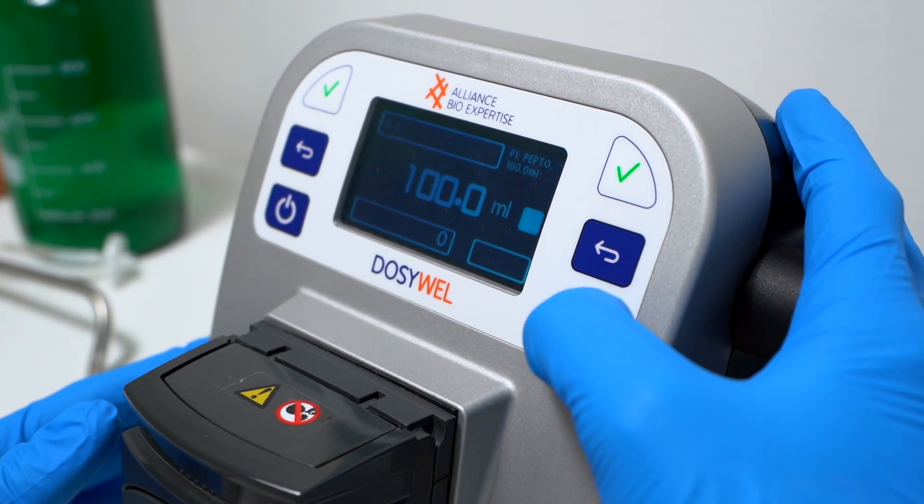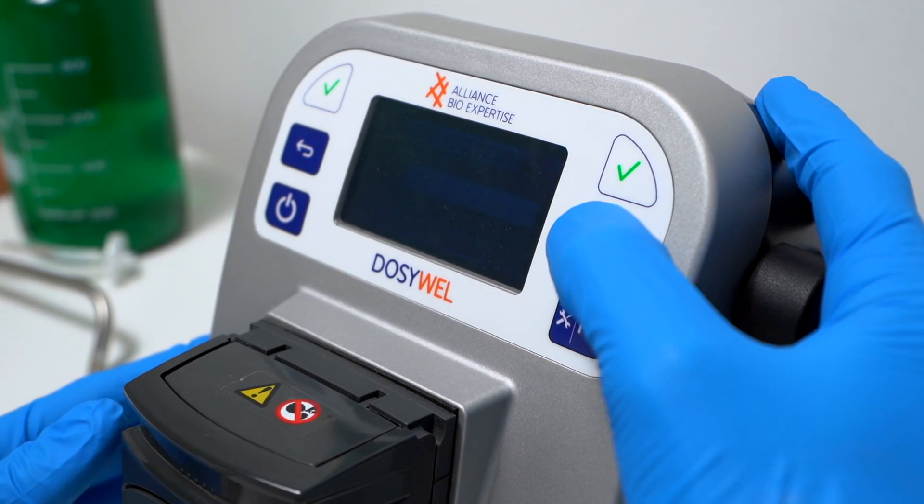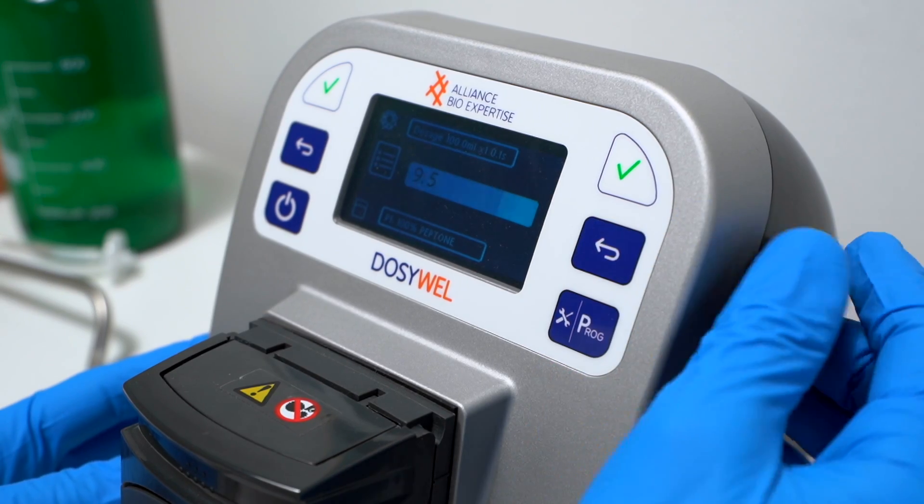A weak point for the Dozy Well is the programming. When you want to do something that is not already set up inside your system, it's really difficult. I guess somebody new inside the lab could have some difficulties to use this kind of tool.